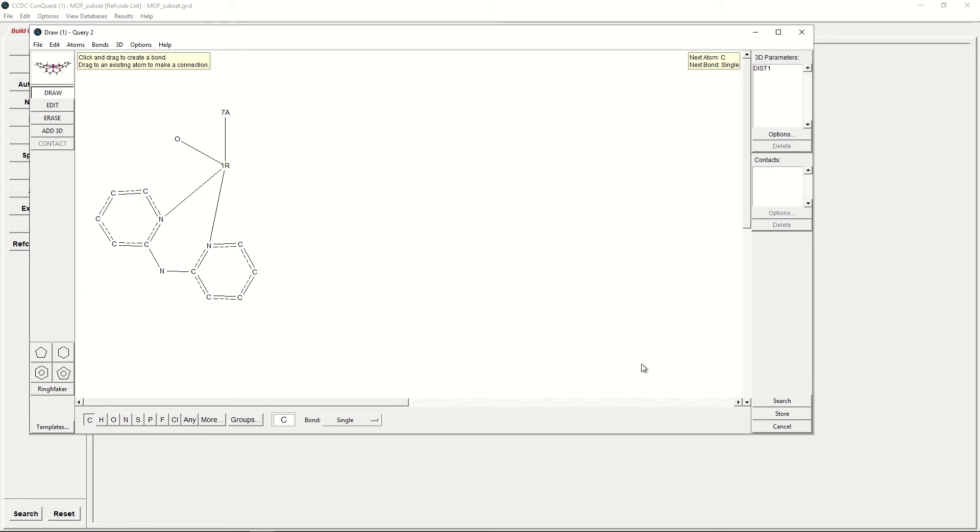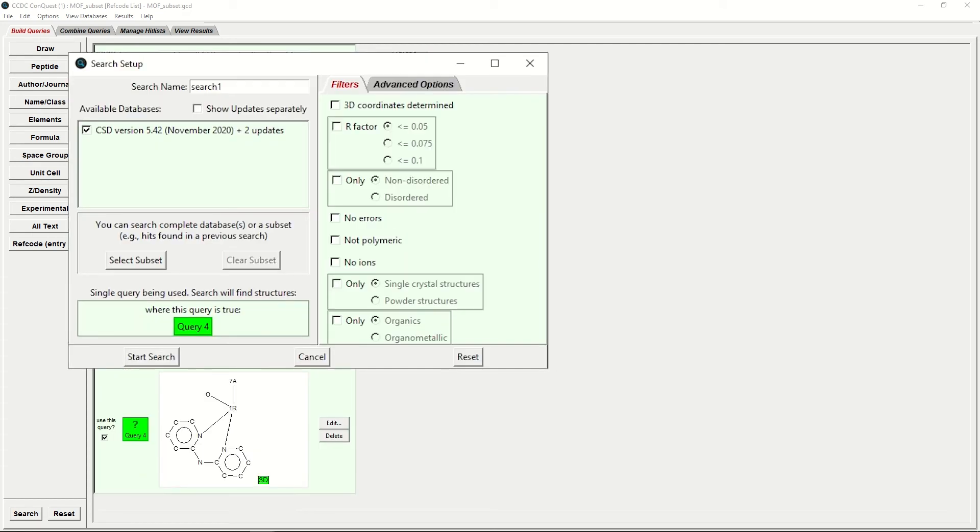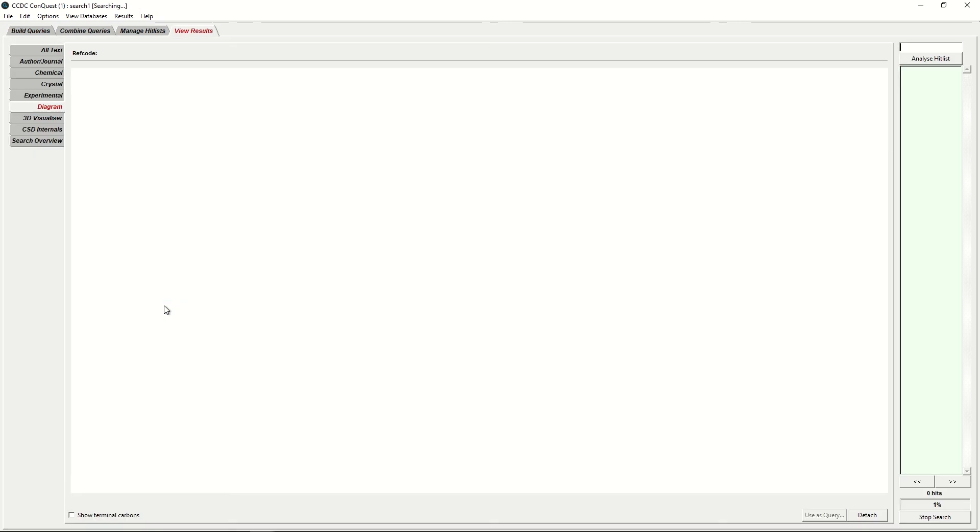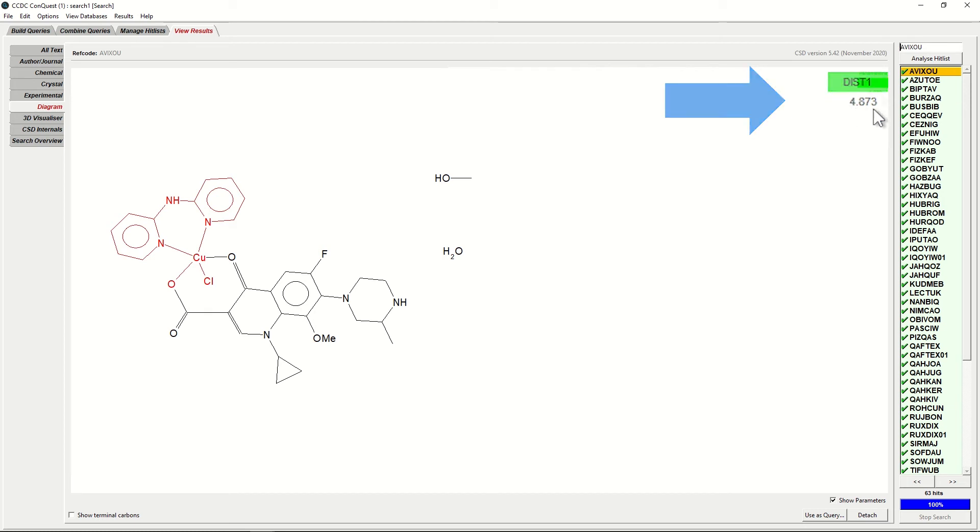Now that our search is prepared, we will click Search on the bottom right. If we do not want to overwrite existing queries, we will click No. We would like all 3D coordinates determined for all of our search. We could tick only Organometallics, however, they will all be Organometallic anyway. Now we're happy, we will click Start Search. This will return a list of hits which all meet the criteria outlined in the previous step. On the top right hand corner, you can see the distance between the centroids as Dist1.